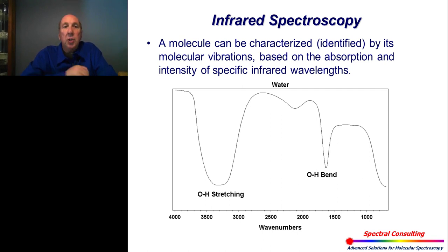So if we change one of the atoms in the hydrogen, from hydrogen to deuterium, the spectrum would change completely. There would be additional information because we have OH stretching and OH bending, and OD stretching and OD bending. So there would be two more peaks that would be added to the spectrum. This information here is actually in overtone mode.